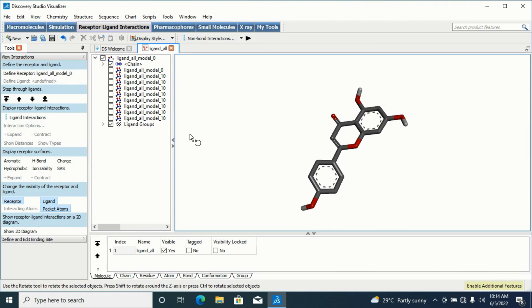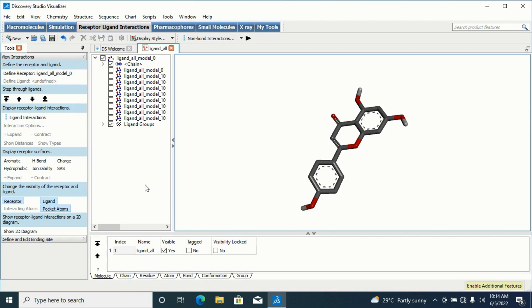On the left side I have different conformations of my ligand generated during the docking process. The docking process will always generate different conformations of your ligand interacting with your protein, so that after docking you can analyze the results and see how the interactions differ across conformations — and identify the one that gives you the best interaction and energy.